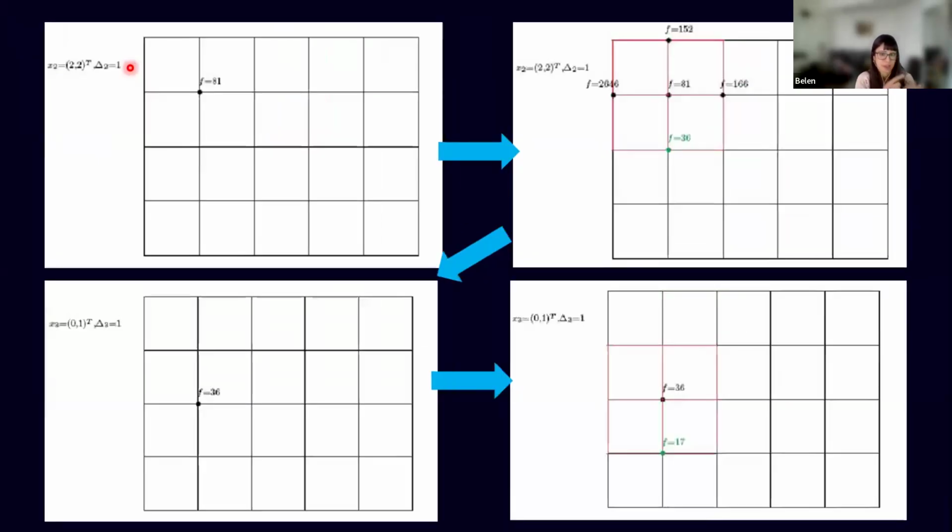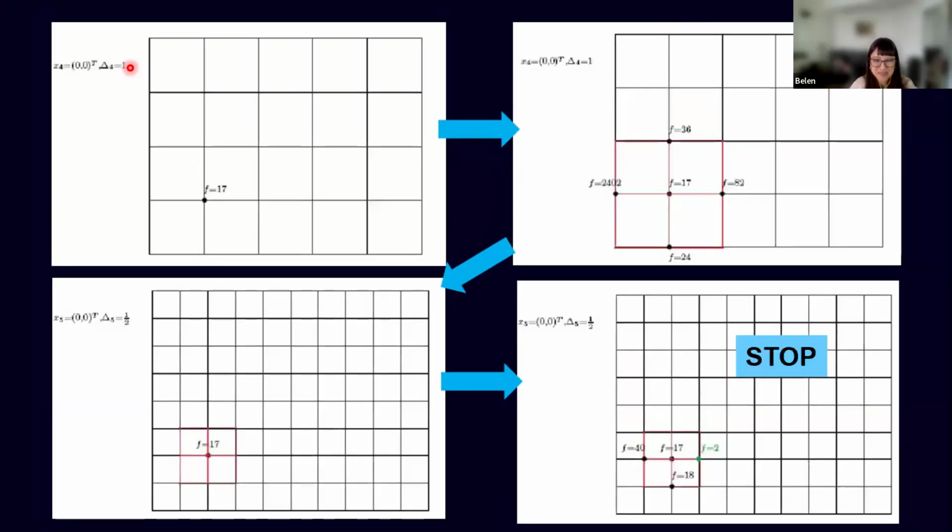And then we repeat. We continue seeking better points as long as we find improvements. And when none of the neighbors decrease the function, well, the next slide, please, Esteban. We shrink the step size and we start again. This method, pattern search, is agile, doesn't need derivatives, handles noisy functions well, and can systematically explore complex hyperspaces. Basically, it is powerful for problems where gradient-based methods cannot be used.